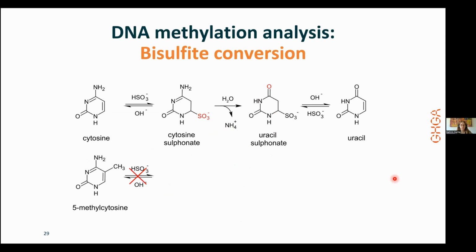Okay, so both ATAC-seq and ChIP-seq were enrichment-based methods, where we only sequence the reads which are accessible, or which have the specific histone modification. And for DNA methylation, we use a very different approach.